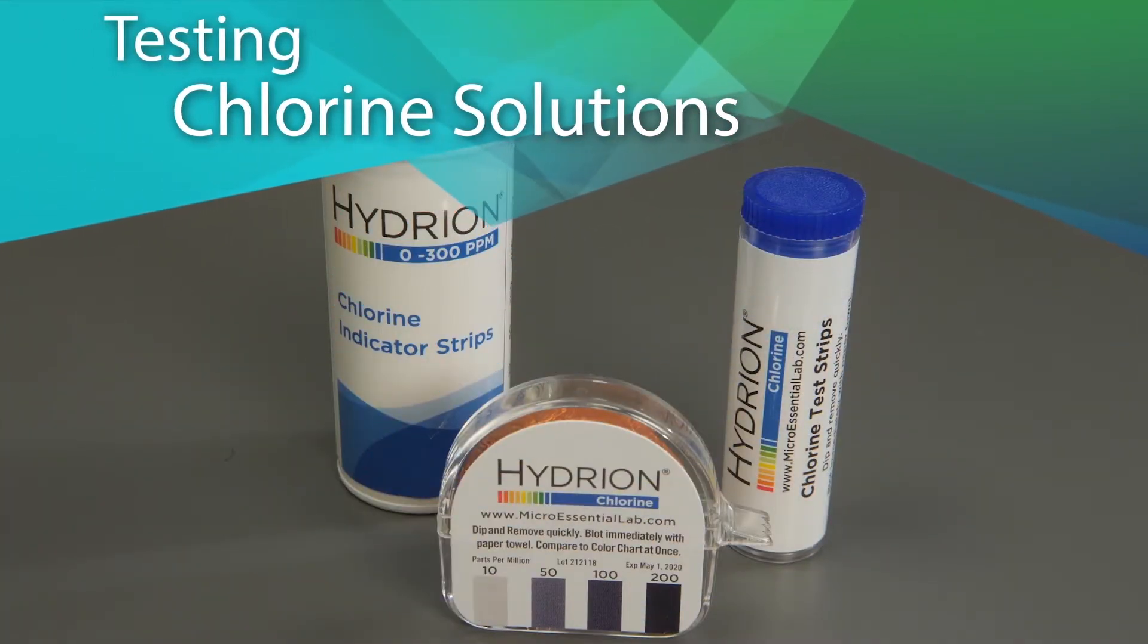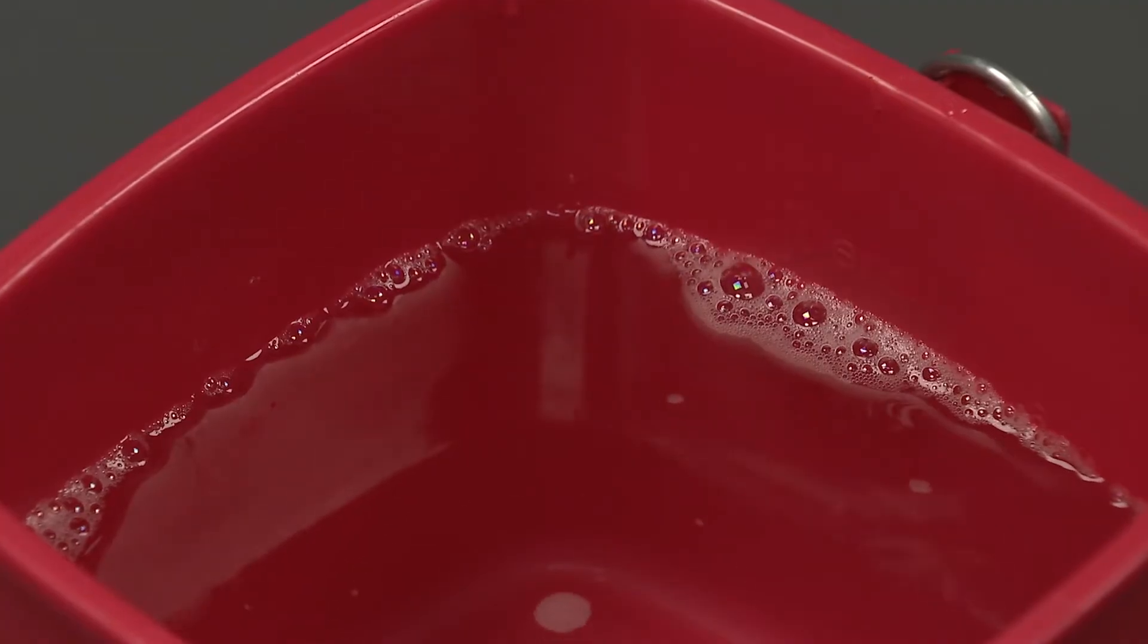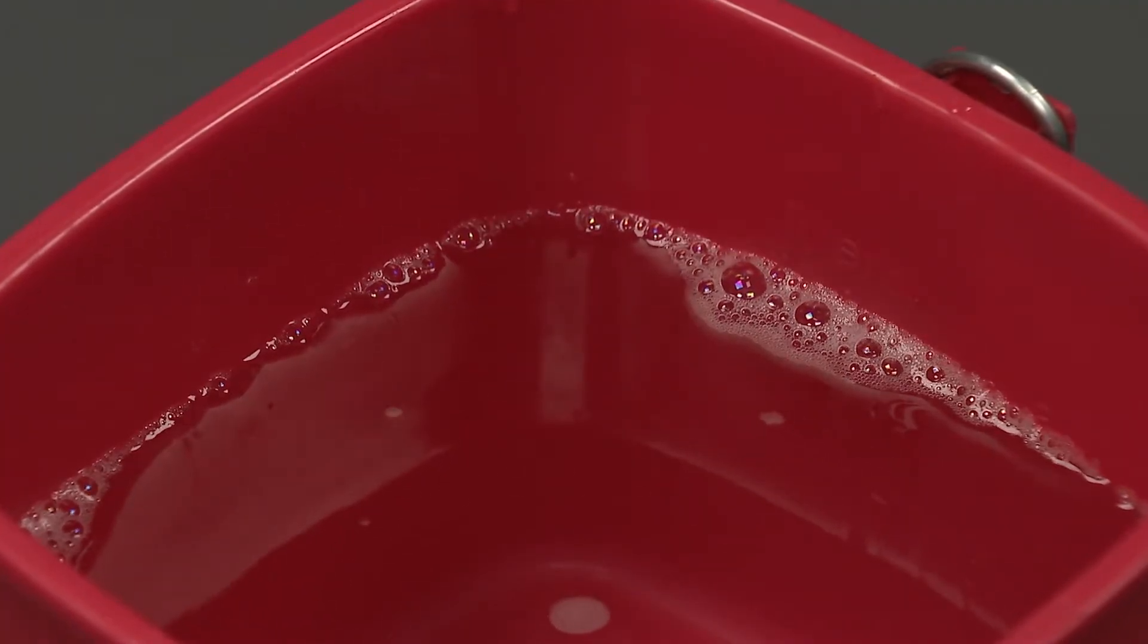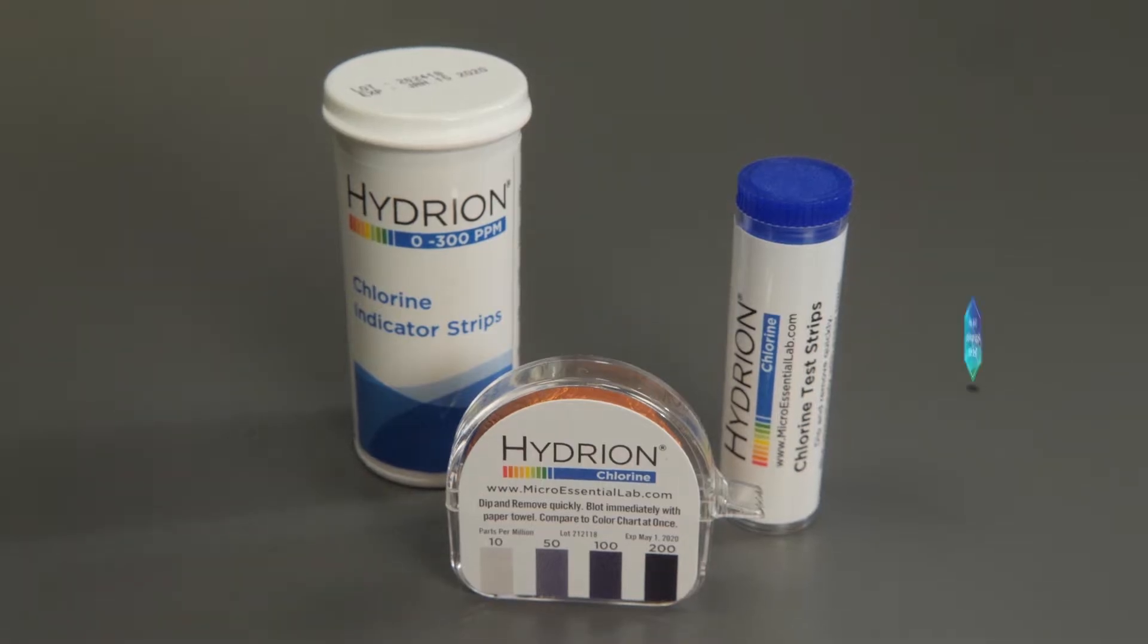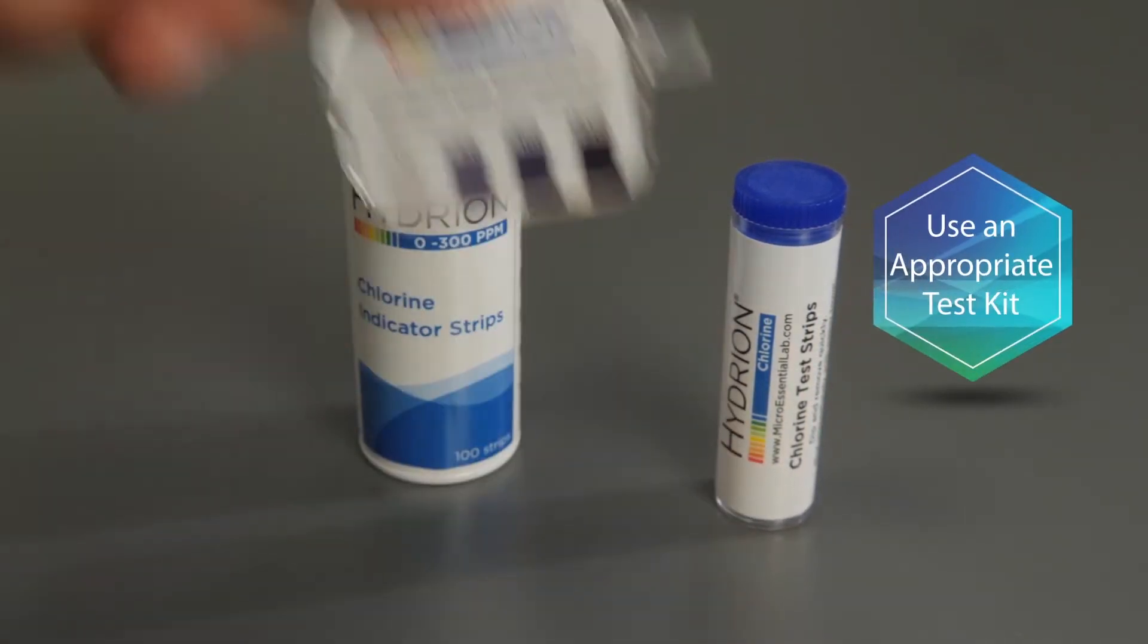Testing Chlorine Solutions. Prepare the chlorine solution according to the manufacturer's instructions. When testing the accuracy of its dilution, use an appropriate test kit like CM240.